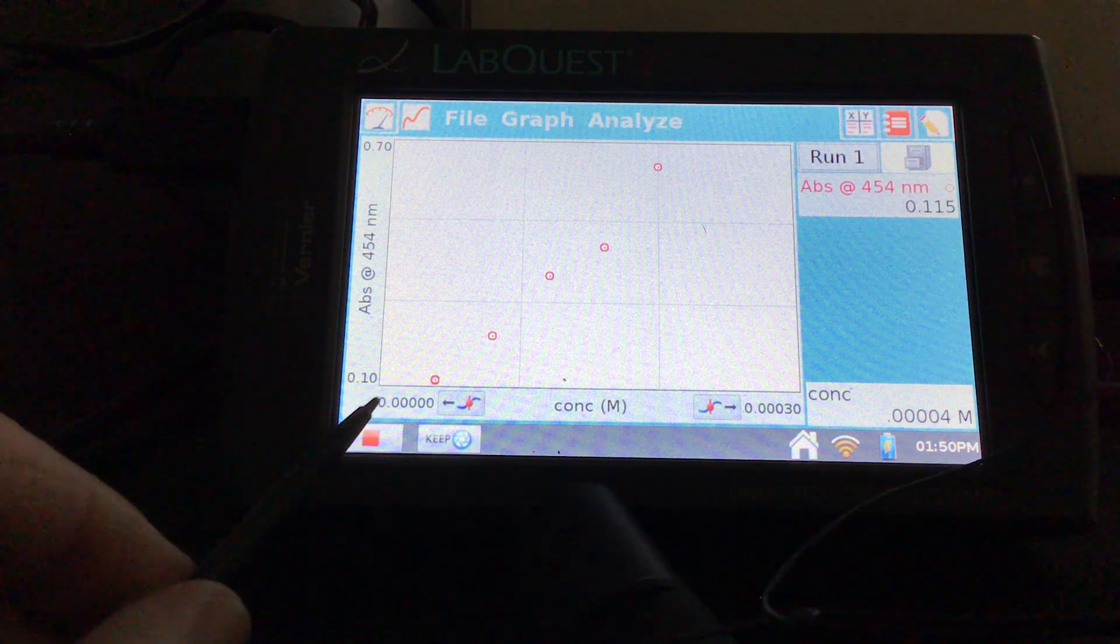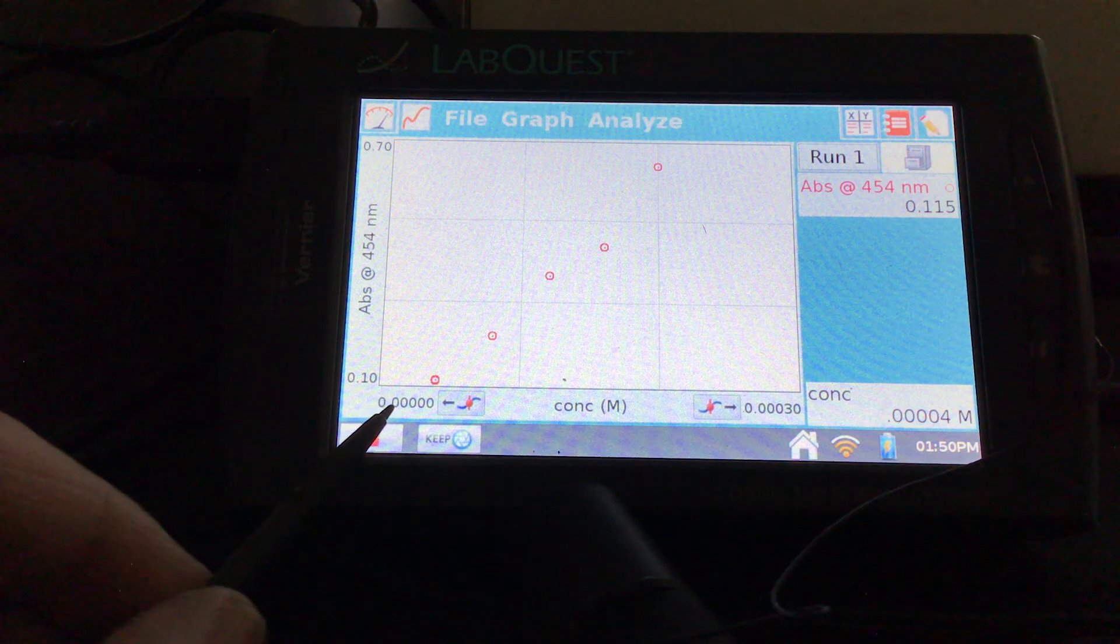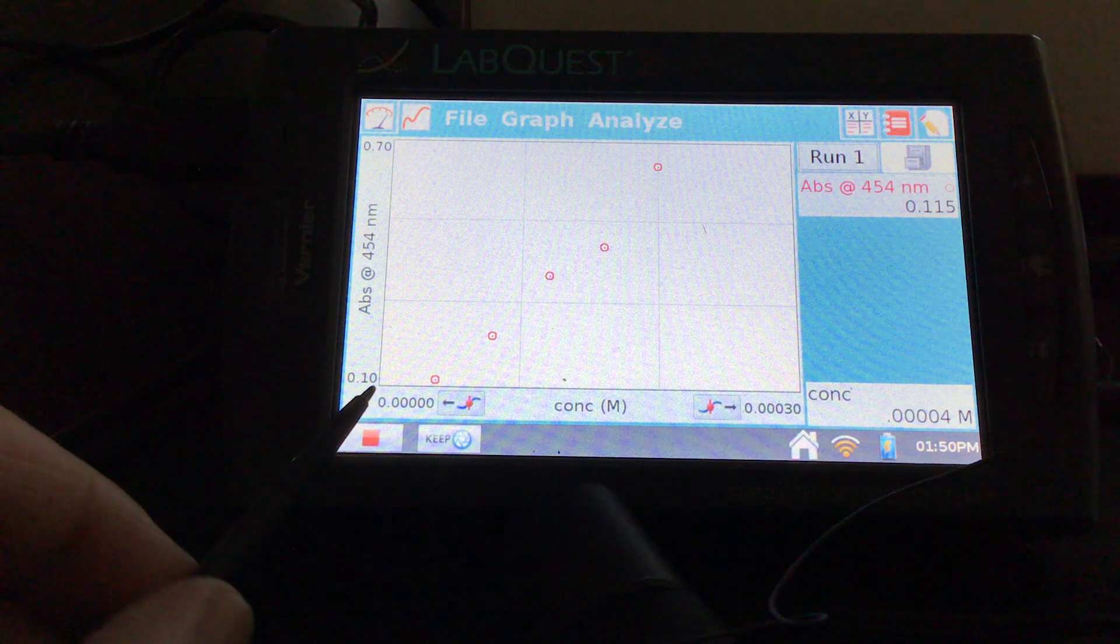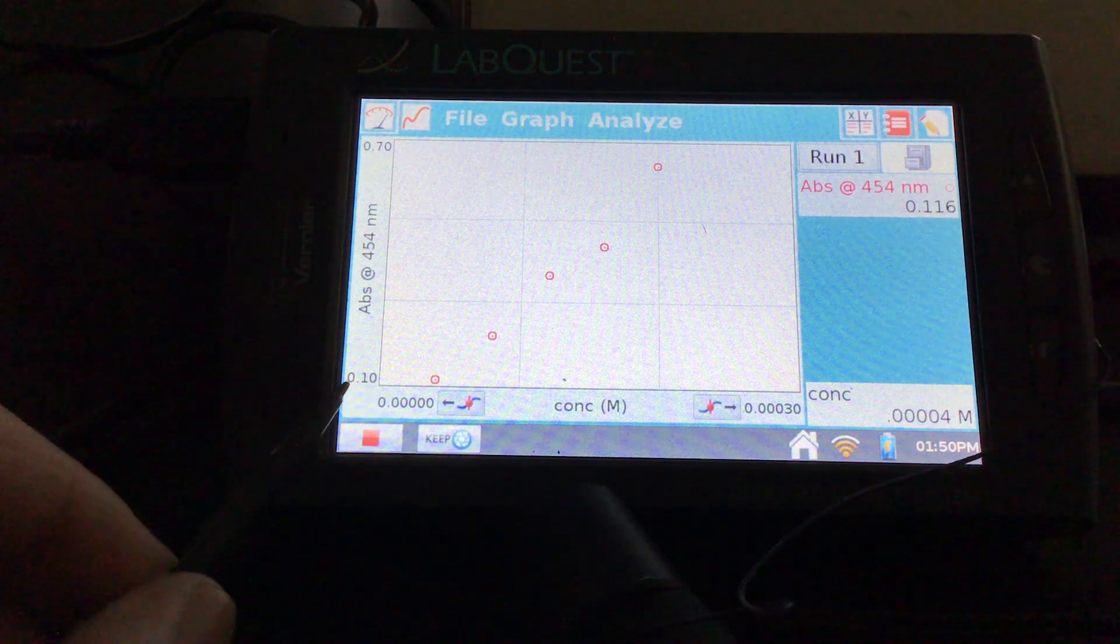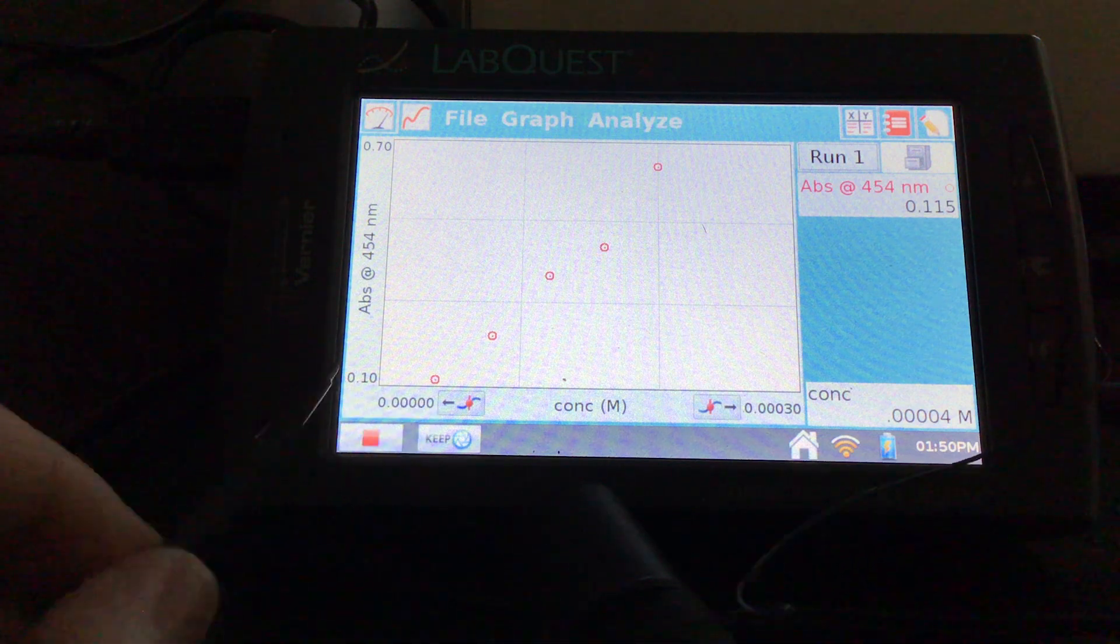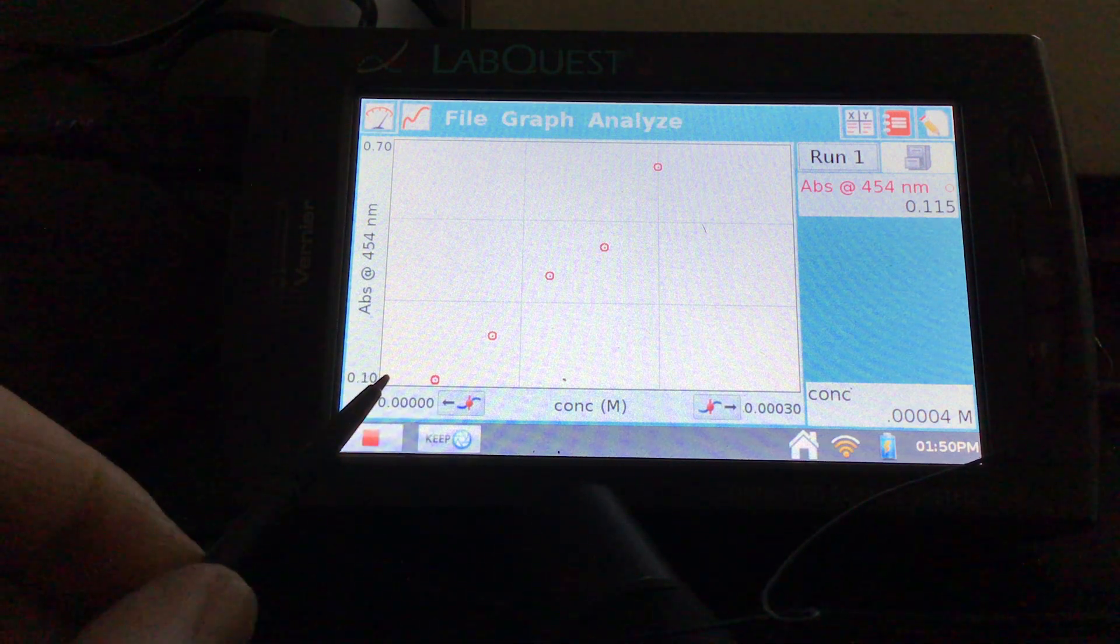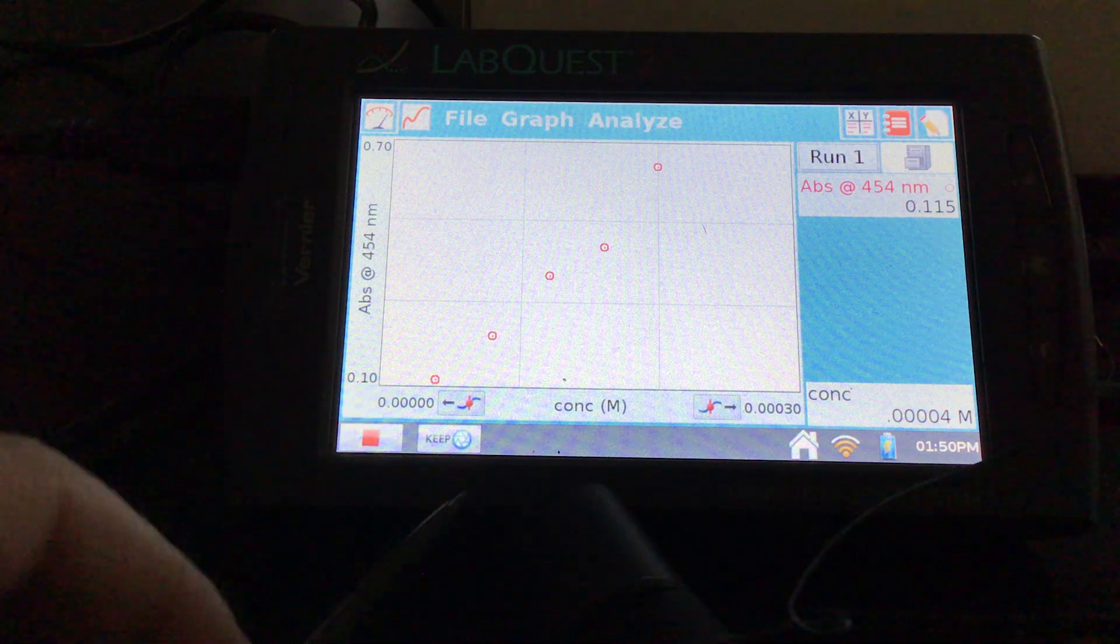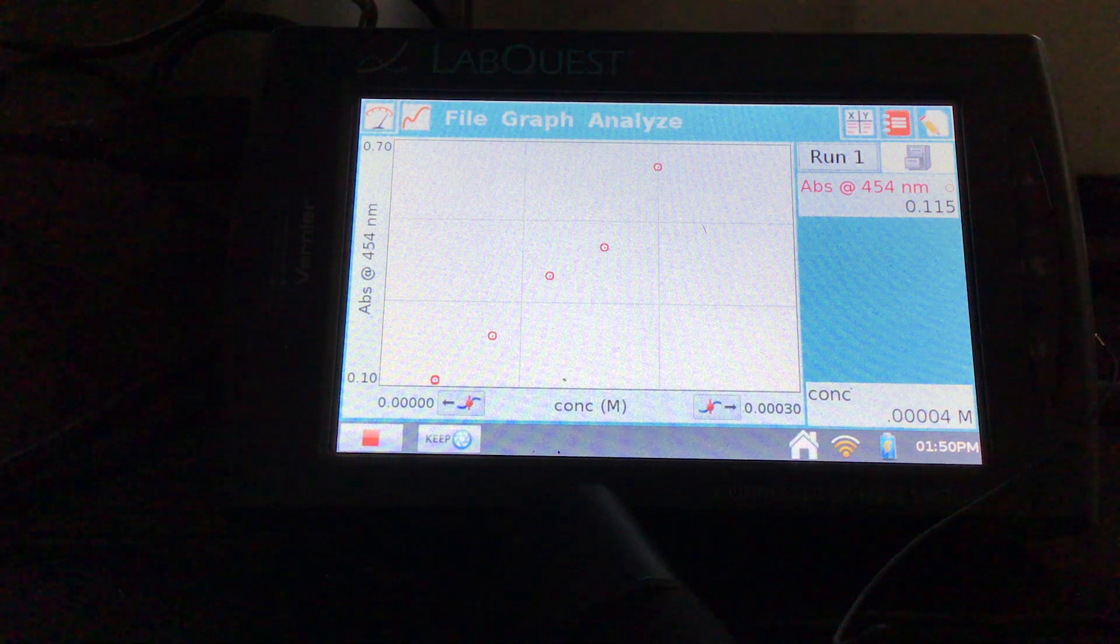Or if you have your equilibrium sample set up, you could just read the absorbance of it and write that down on a separate sheet of paper. But we're going to end up coming back to our equilibrium system. But if you read your sample at this point, just don't keep the data. All right. This is our unknown sample. So it's not part of our standard or known concentrations of solutions. So I'll kind of show you both ways and hopefully it'll work both ways.